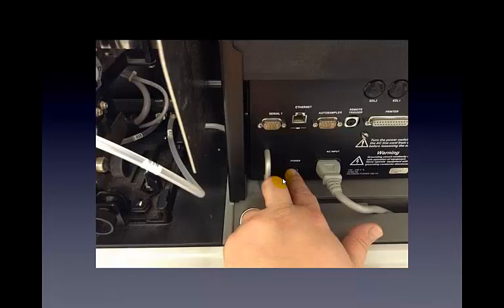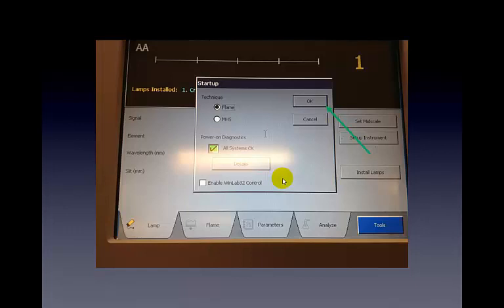Once the lamp is fully installed, press the power switch, which is located on the front panel on the bottom left-hand side. After a short delay, you'll hear the computer turn on and you'll be able to watch it boot up and load the software. The first dialog box allows you to select the technique — the flame technique is the default, and that's the one we want, so press OK.